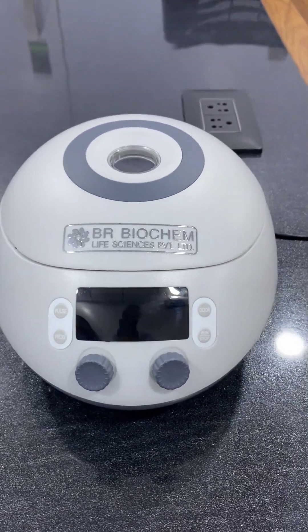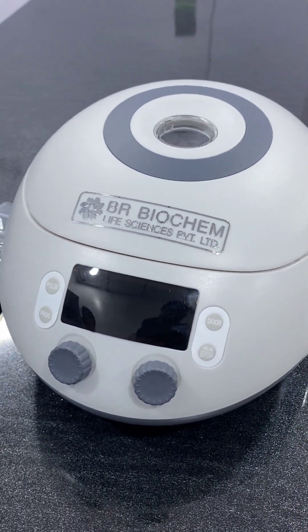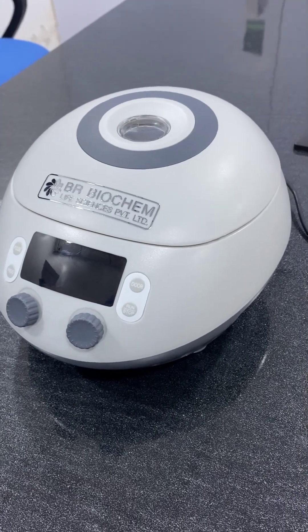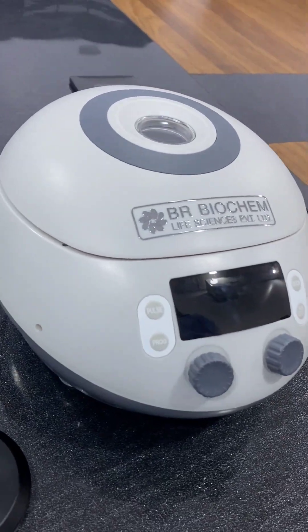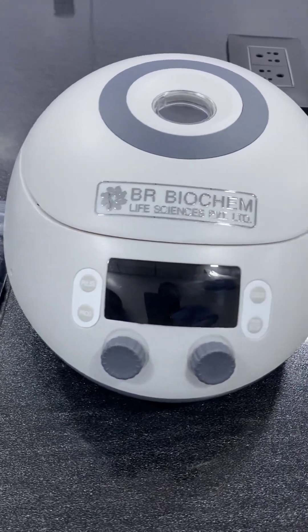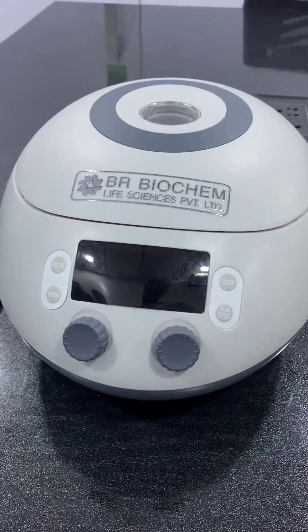Hello everyone, welcome to BR Biochem Life Sciences Private Limited. This is our high-speed centrifuge. The speed range of this centrifuge is from 500 RPM to 15,000 RPM, meaning you can set the speed according to your requirement. The speed range increment is 100 RPM. You can insert 0.2 ml, 0.5 ml, 1.5 ml, and 2 ml centrifuge tubes.